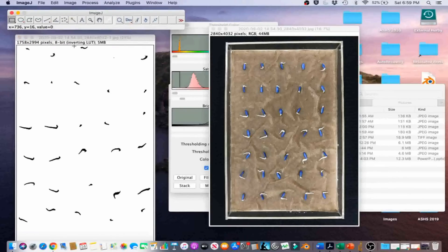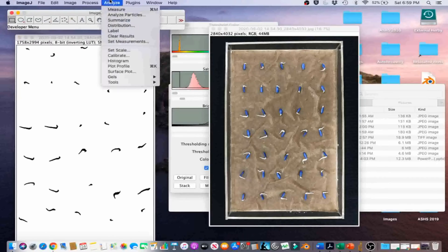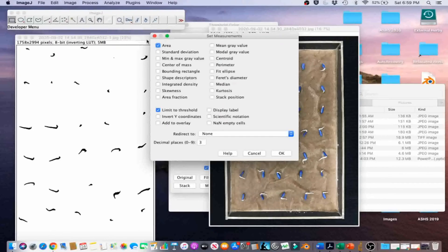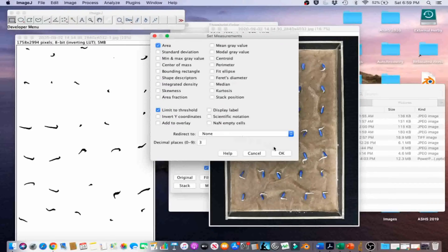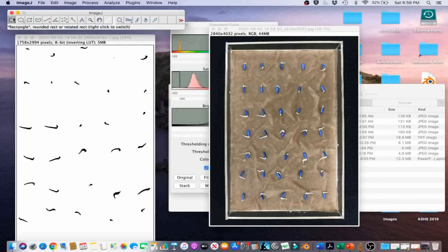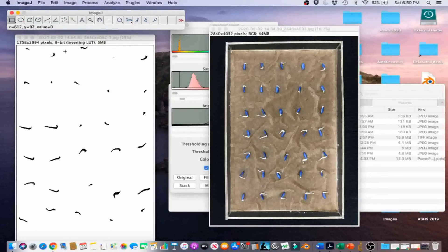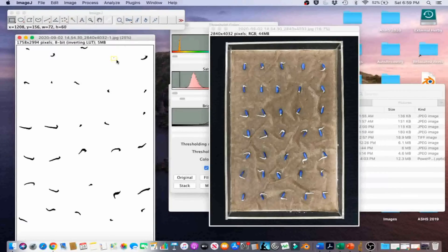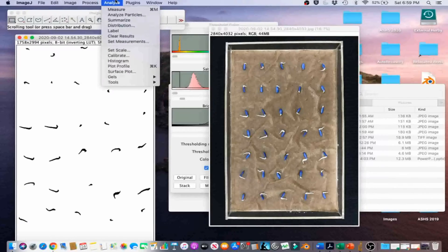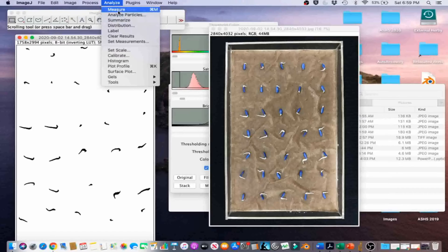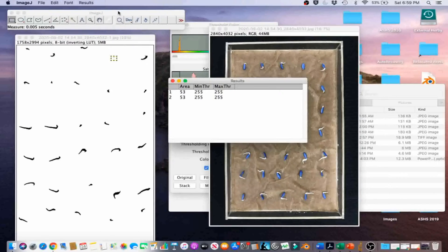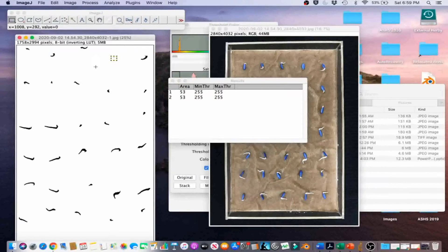We're going to have to go to Analyze and Set Measurements and select Area and Limit to Threshold. Go ahead and click on OK. Then we're going to select the Rectangle tool again, and we're going to select the area of the smallest emerged radical, which is right here. Then we're going to go to Analyze and Measure, and we can also do Ctrl-M to measure the radical area.